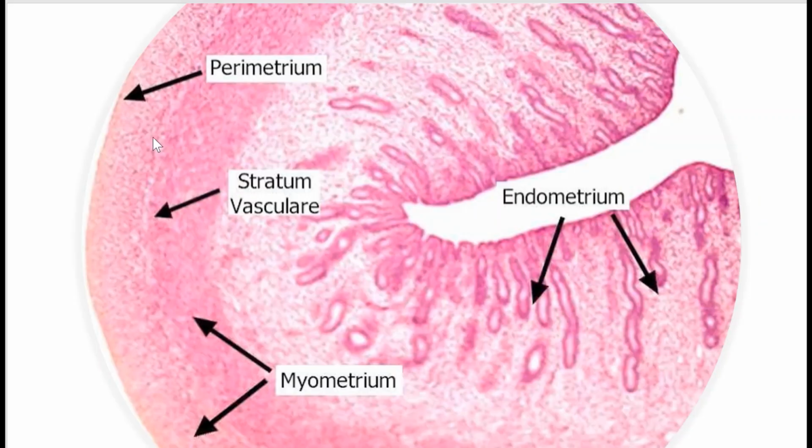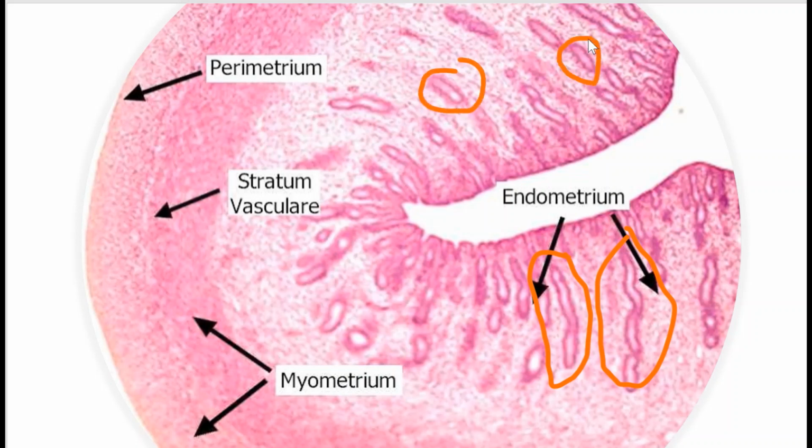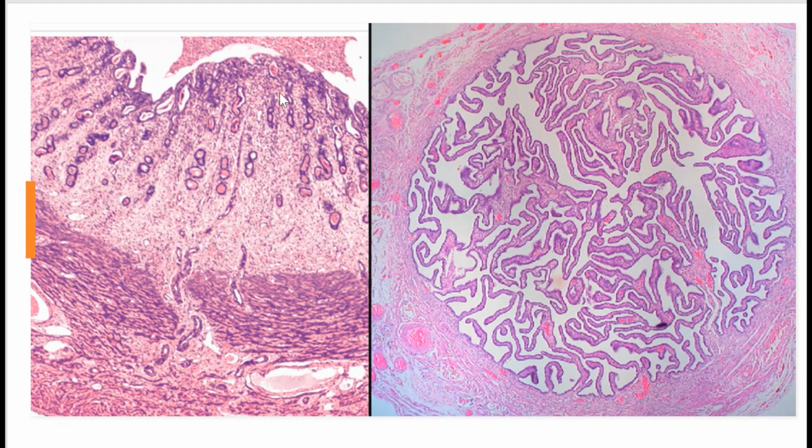If they are not slithering like a snake, and they're kind of long or short and straight, like they're just doing a little bit, they're not doing a whole lot, this is going to be your proliferative stage or phase, whichever one you want to go with, remember, because you can do whatever one you want.